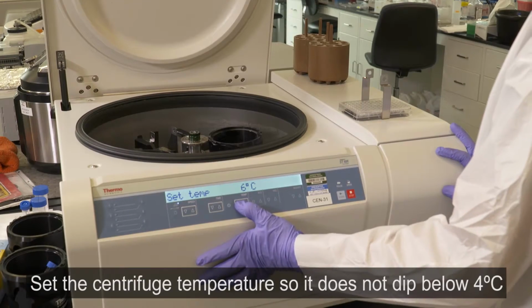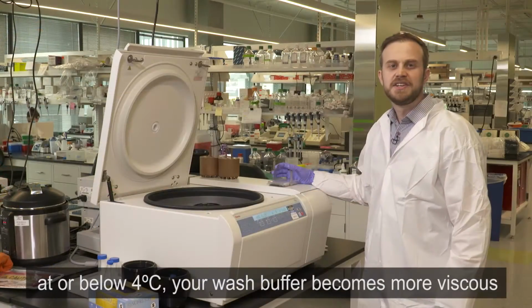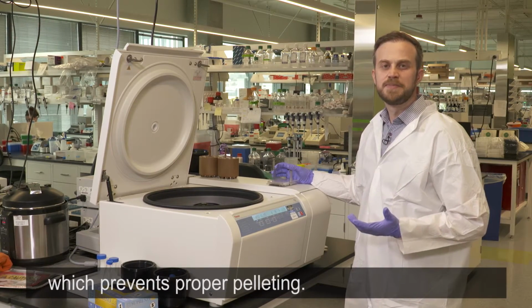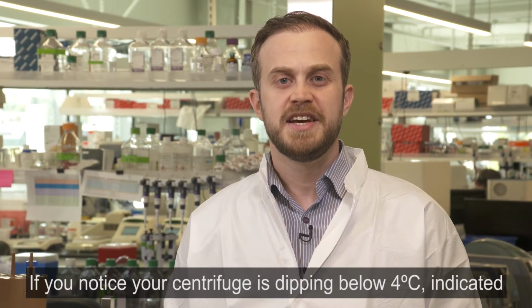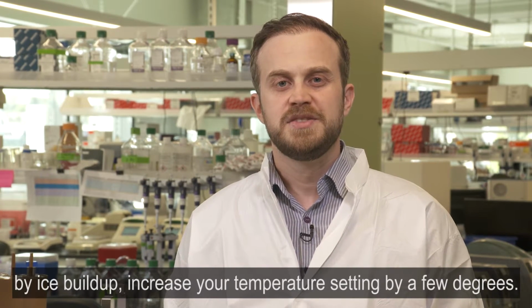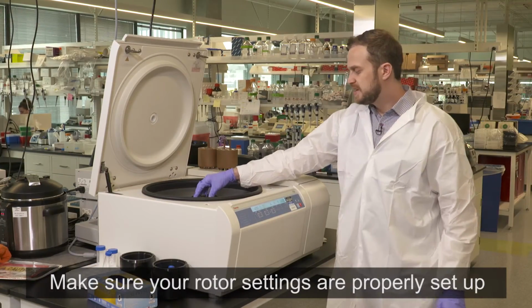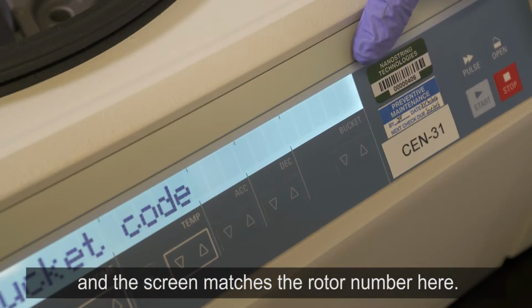Set centrifuge temperature so it does not dip below 4 degrees. At or below 4 degrees, your wash buffer becomes more viscous, which prevents the proper pelleting. If you notice your centrifuge is dipping below 4 degrees, indicated by ice buildup, increase your temperature setting by a few degrees. Make sure your rotor settings are properly set up on the screen, matches the rotor number here.